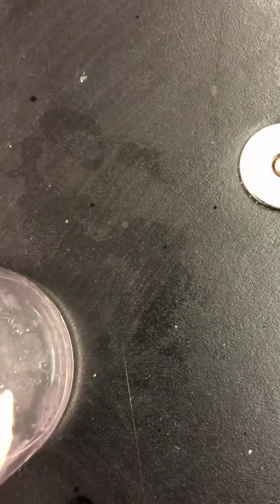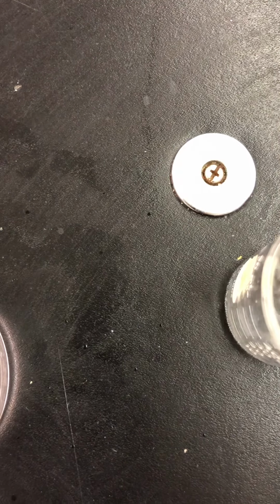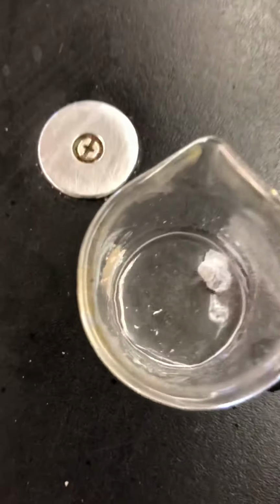Finally solid 5. So I'm going to put solid 5 into a beaker. I'm just going to drop one piece in. And I'm going to add some water. And I'd like you to watch.